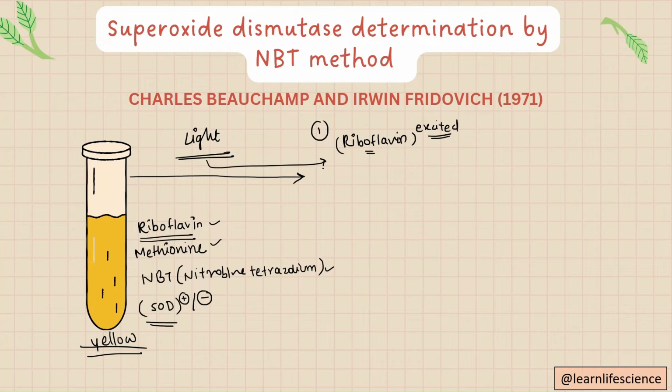These vitamins have the ability to absorb light, and that's why they get to their excited state. Now, in order to return to their ground state, the energy is transferred to the oxygen molecules present. The oxygen molecules which are present here will now receive this high energy.